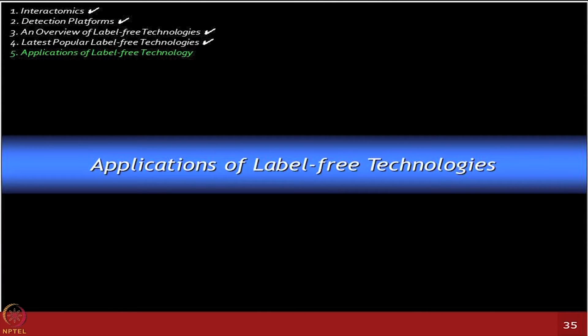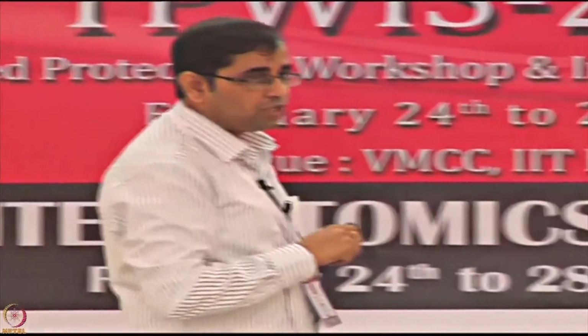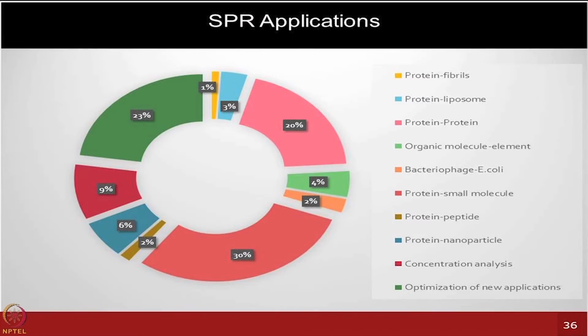I'm restricting the applications right now mainly to SPR, because that's what we currently have available at IIT Bombay. I'm also running a core facility which offers services for many types of applications for internal and external users. This distribution shows that we are doing all kinds of applications here, from protein fibril interactions to protein liposomes and protein with various organic molecules.